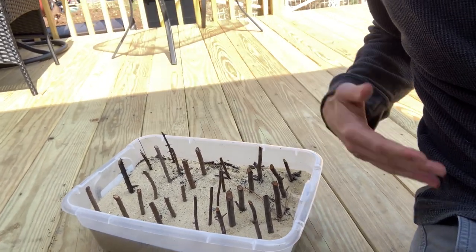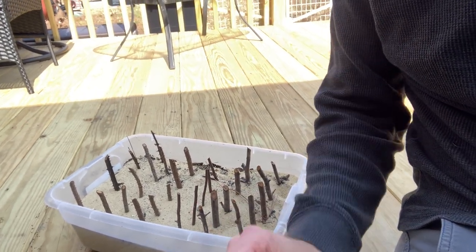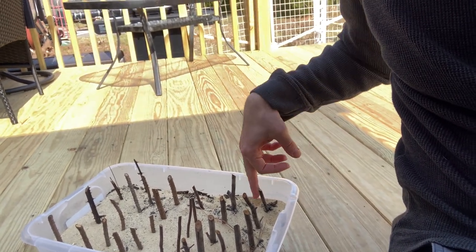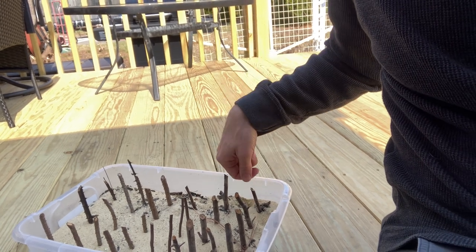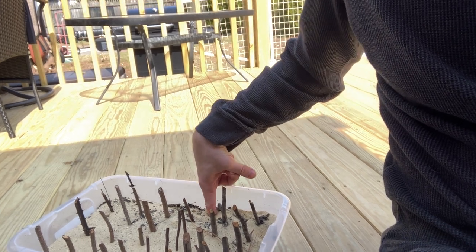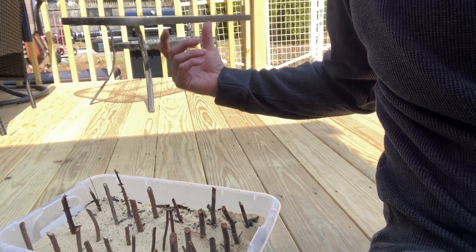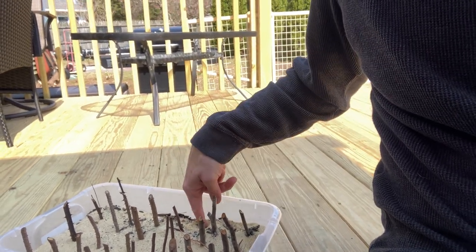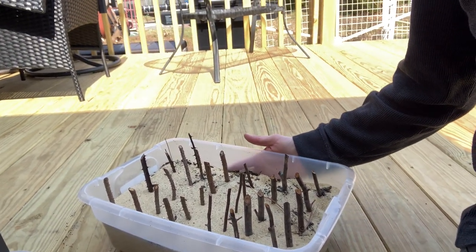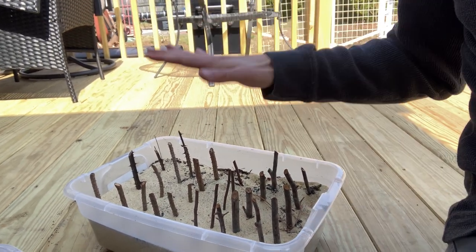With your cuttings, if you're going to use a rooting hormone you would first dip them in the rooting hormone. Have a little indentation already made — the medium should be a bit wet — then stick your cutting right in. You want to make that pre-drilled hole because as you're pushing the cutting in you don't want the rooting hormone to get removed as the cutting gets pushed in. Really simple again for hardwood cuttings: take them, dip them in rooting hormone, and put them in.